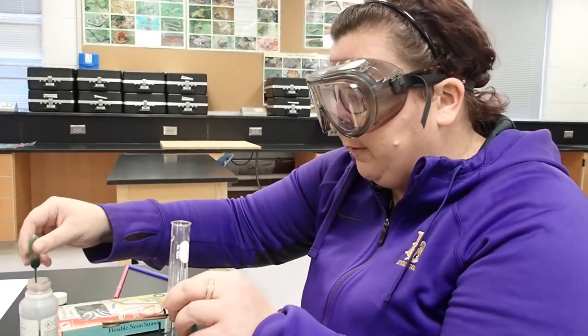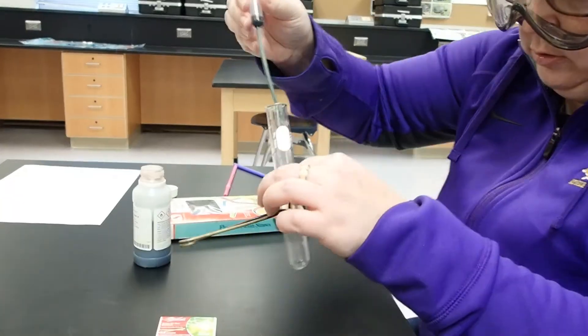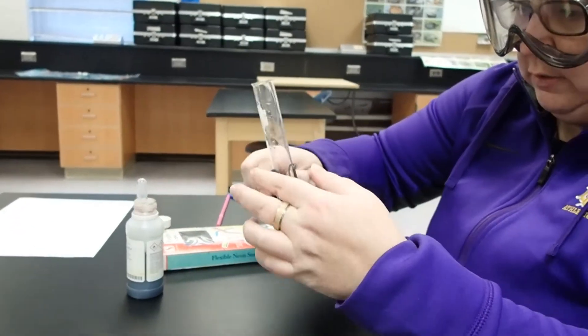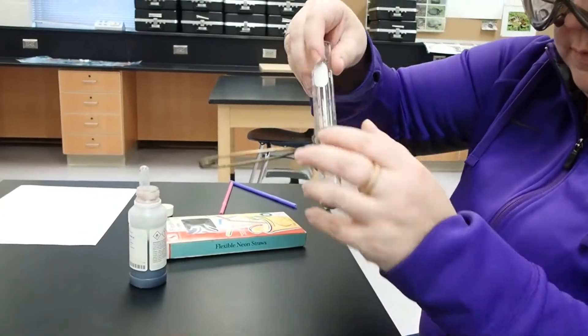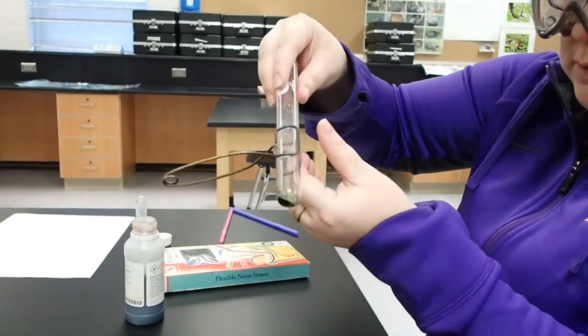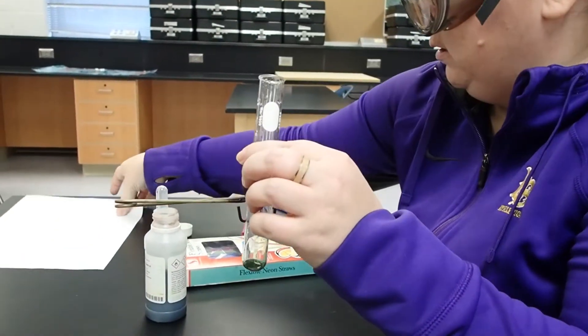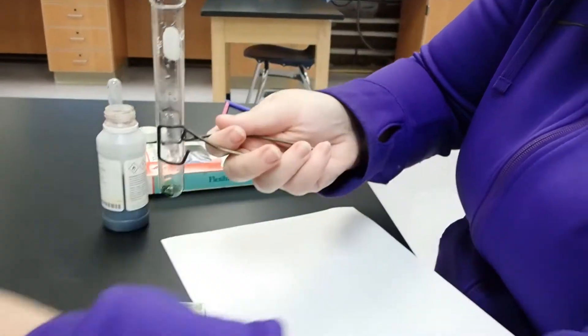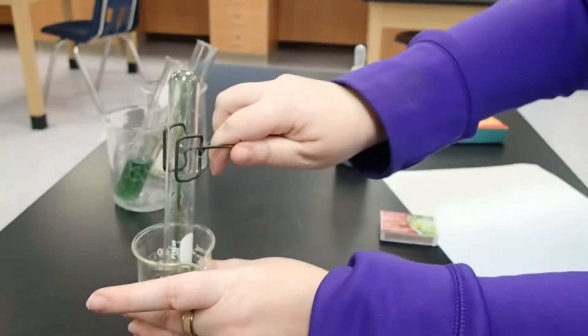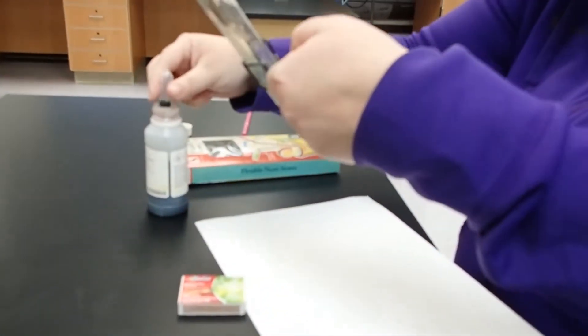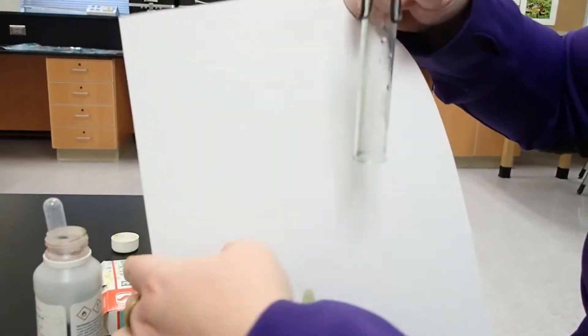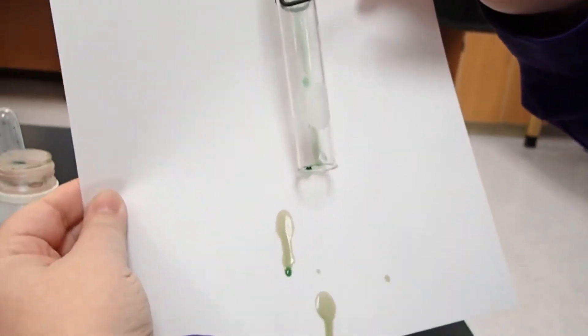I'm going to put in a couple drops of indicator into my test tube and just swirl it around to coat my test tube. It will be a little harder to see the color. It may have been a little too wet. Hopefully you can see that the inside of the tube is green in color.